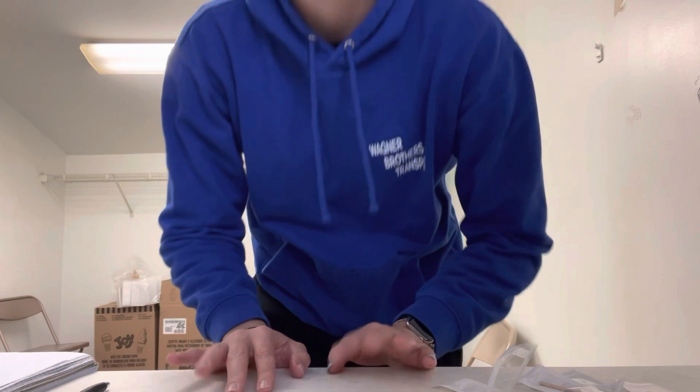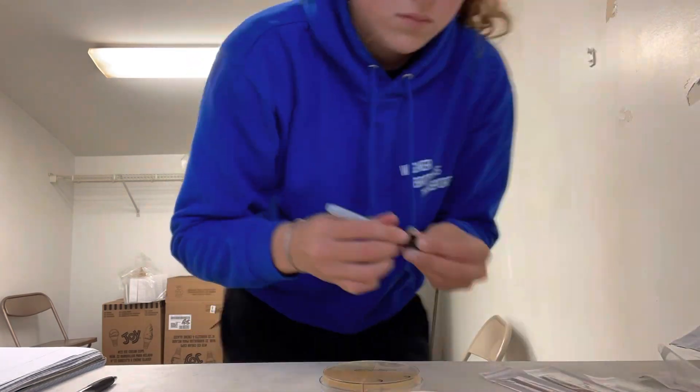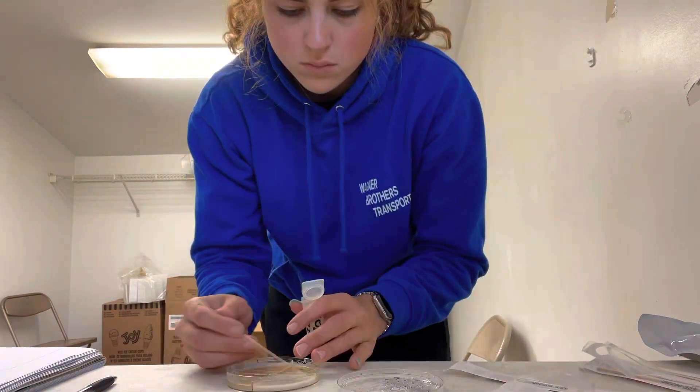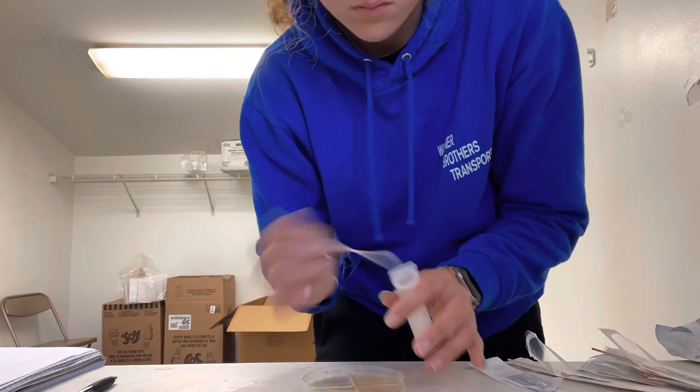The incubator is set at 37 degrees Celsius, so it's pretty warm Fahrenheit-wise, and it's going to cook the bacteria on the plate, and then tomorrow we're going to check and see what grew. Now we have to keep the samples for a little bit just in case we need to do further testing, so their number and what quarter they are is written on the side. But we're going to write it on the top as well just in case the writing on the side gets smeared or smudged or wiped out.